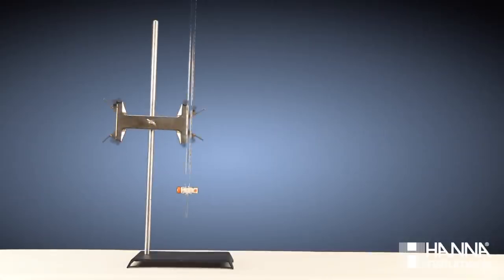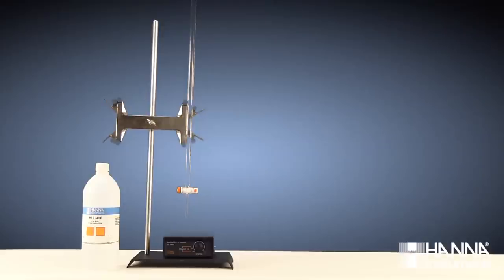To perform a manual titration, we'll need the following equipment: a burette and ring stand, our titrant, which today is HI7046, 0.1 normal sodium hydroxide, a stirrer and stir bar, such as our HI190M.